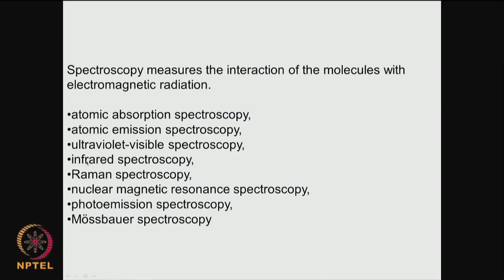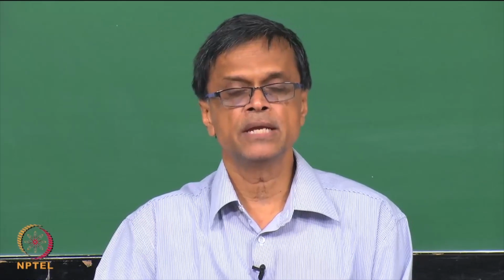So, we will talk more about these two; we will not spend much time on the remaining. Infrared, IR or FTIR, Fourier transform infrared, is a very powerful and useful tool which we will be looking at quite a lot in the biomaterial area.